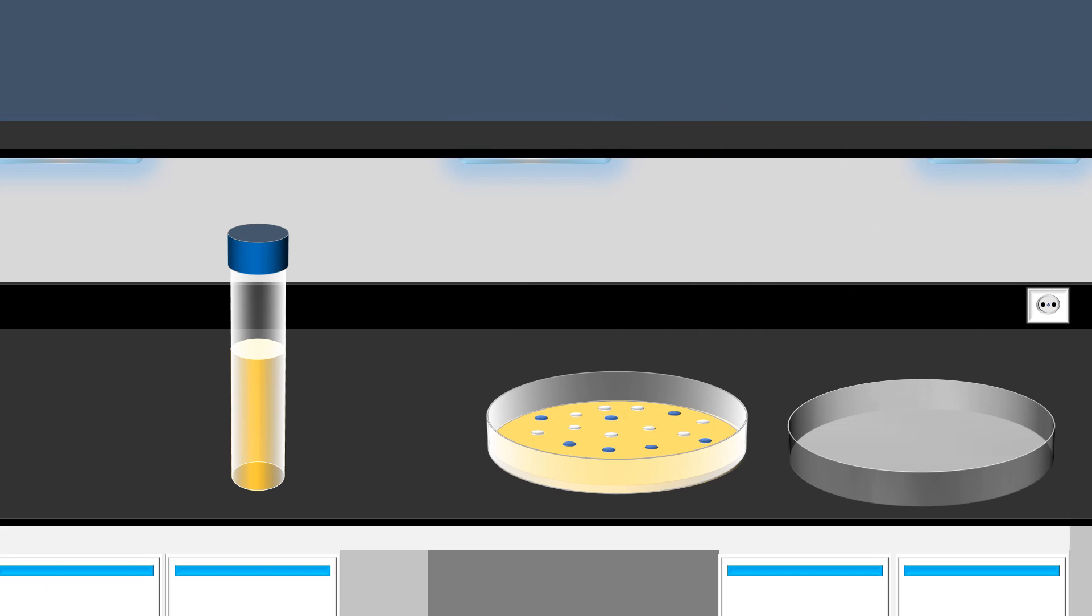Next, the white colonies, representing transformed bacterial cells with the recombinant vector, are isolated and transferred to an enriched culture medium, using an inoculation loop.